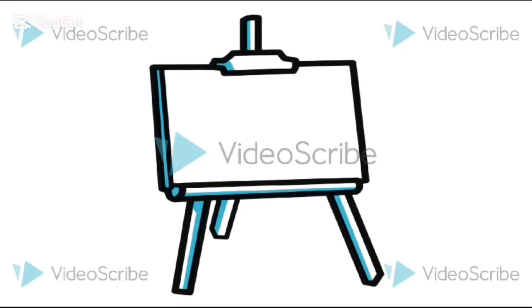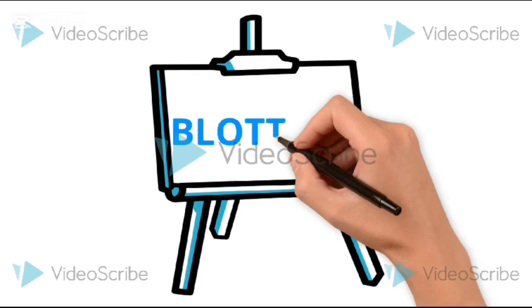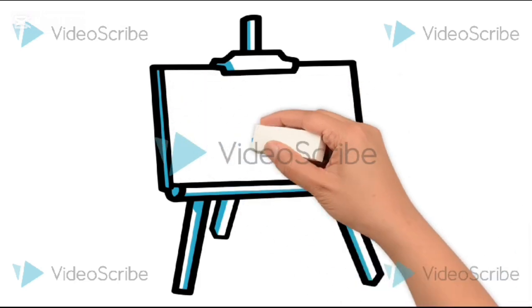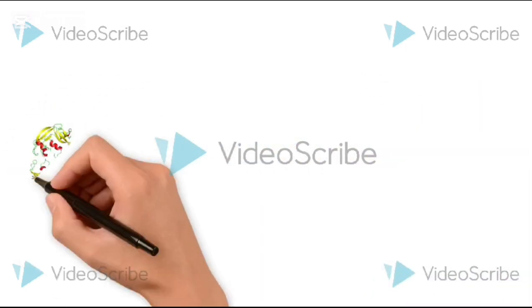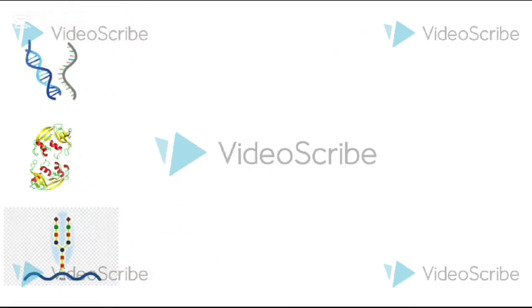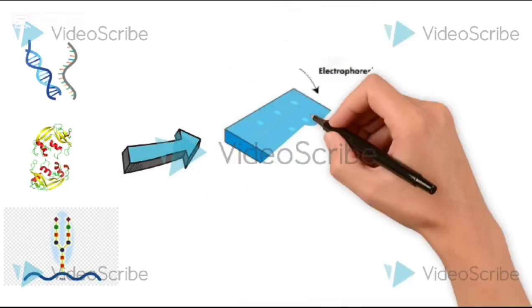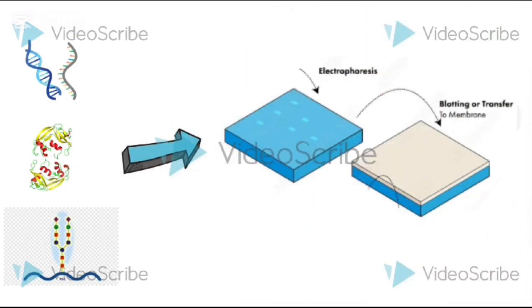In this video, we are going to discuss blotting in detail, its types and its procedure. Blotting is defined as the transfer of biomolecules like DNA, RNA, proteins, and other modified biomolecules from an electrophoretic gel to a membrane for further analysis.